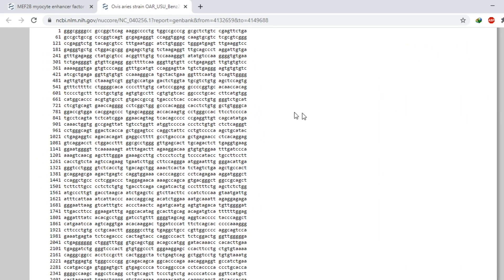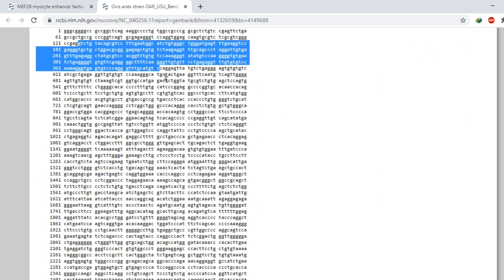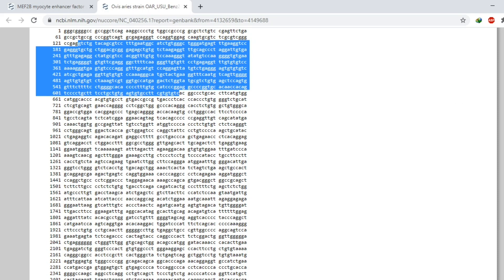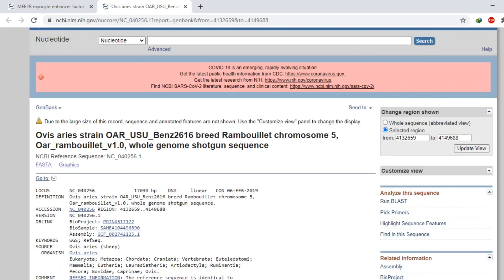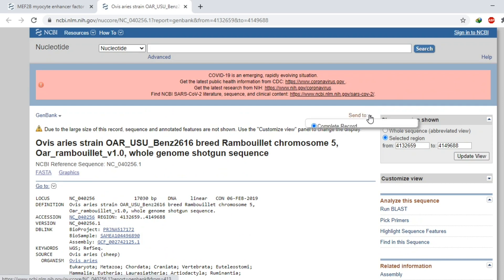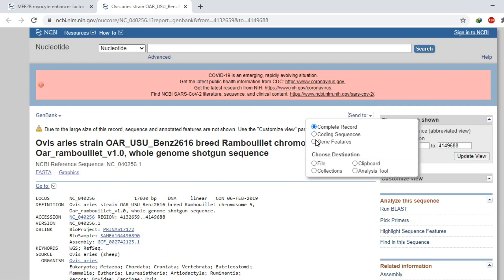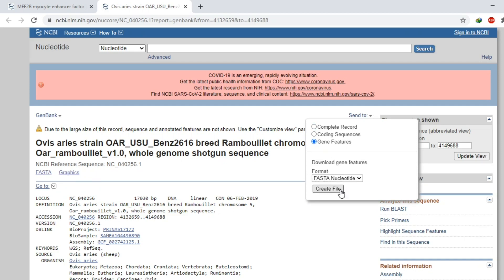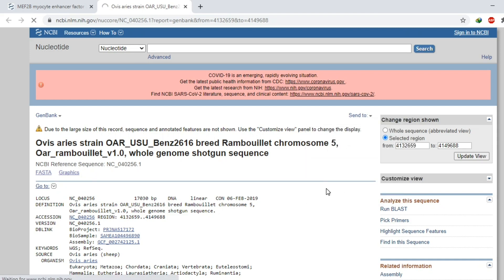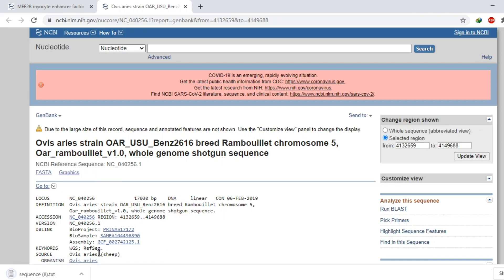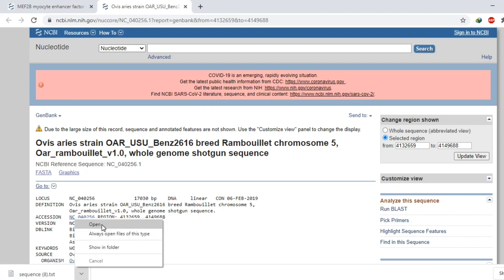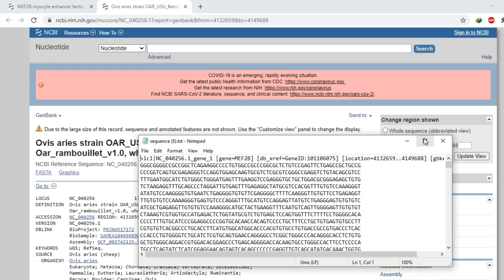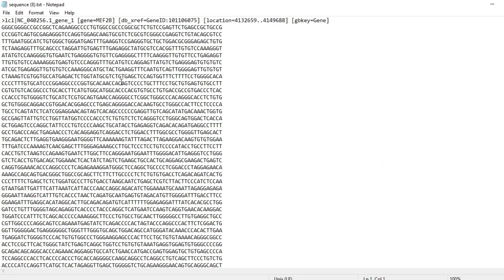We are interested in downloading this sequence. To do so, we will click on 'Send to', then click on 'Gene Features'. We are interested in FASTA nucleotides, so we will click on 'Create File' and our file will be downloaded. After downloading, we can open this file and see the complete sequence of our gene.